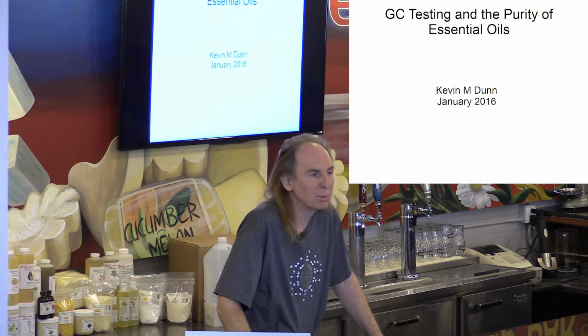This is a project that we started in the middle of last year. Derek wanted to test the essential oils from Essential Depot, so he donated a chunk of money to Hampden-Sydney College, which helped us to buy a new gas chromatograph. And now I'm going to explain what we do with it.